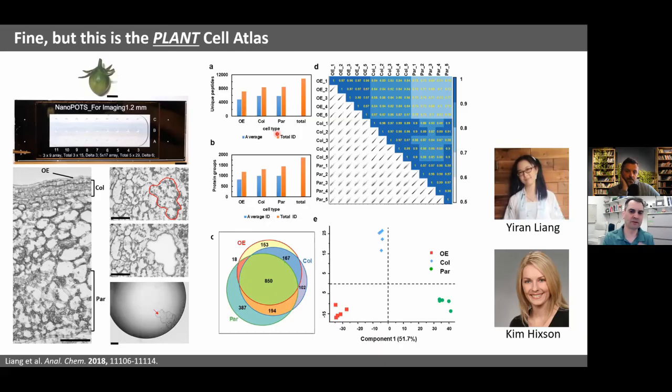And so we could look at what our proteome coverage is, and whether we are able to differentiate the protein expression from these different regions. You can see here that with just a simple PCA analysis, we could readily differentiate the different tissues depending on the region that they were isolated from.